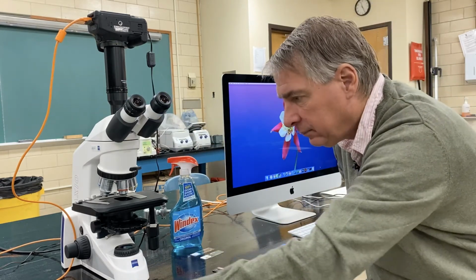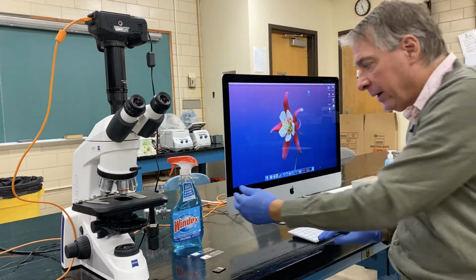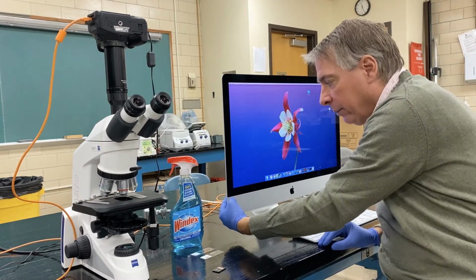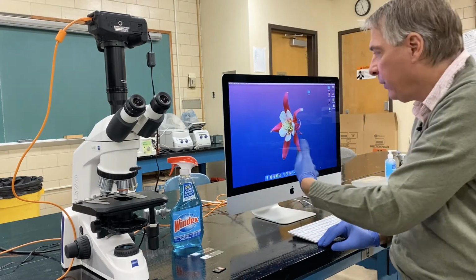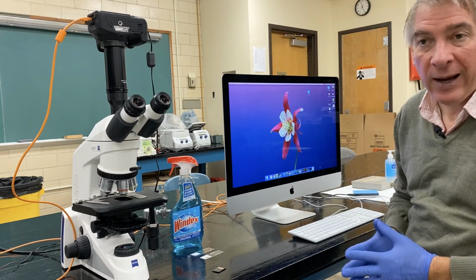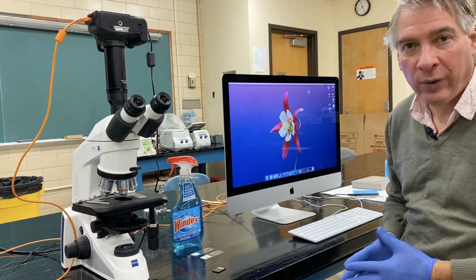Okay. Then we have to power up the computer, which I've already done by pressing the power button on the back side of the lower left-hand corner of the monitor. Once the computer's on, we need to log in, and the ID and password is the same, bioimaging for each, all lowercase, all one word.